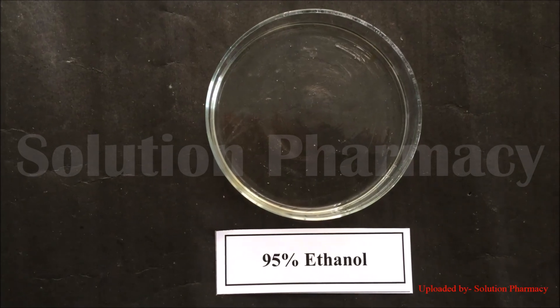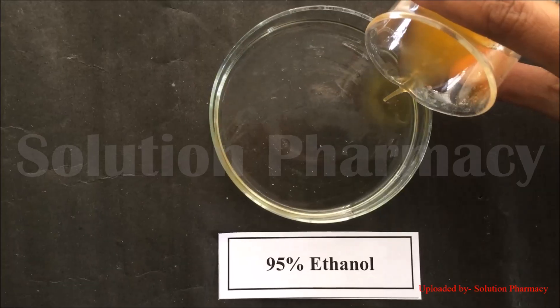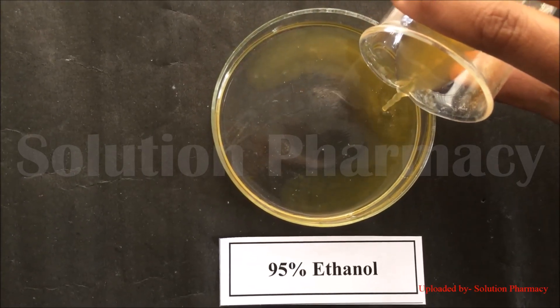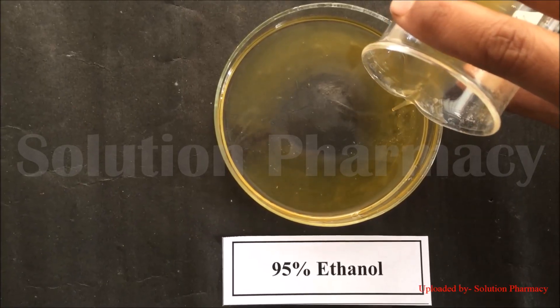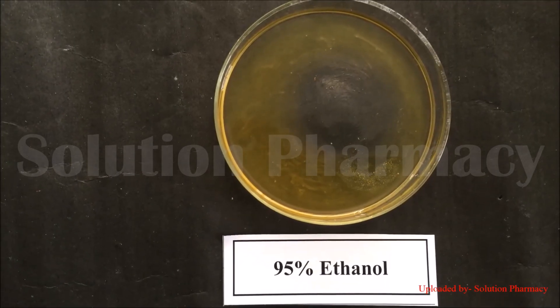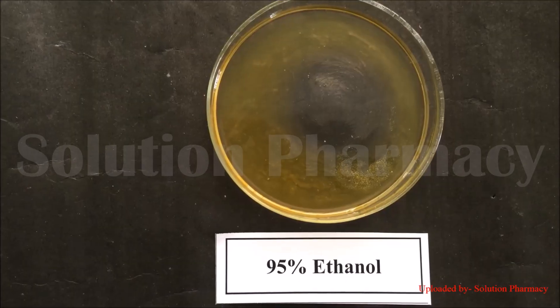Transfer 20 to 30 ml of 95% pre-cooled ethanol into a petri dish. Now slowly pour the papaya filtrate into the petri dish containing pre-cooled ethanol. You can see fine thread-like structures forming in the petri dish. You can also use isopropanol instead of ethanol.